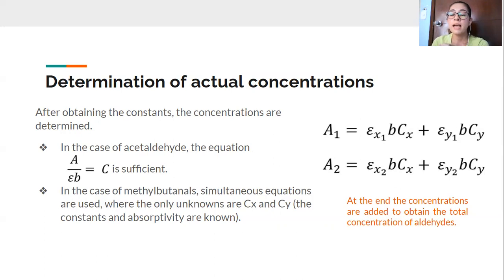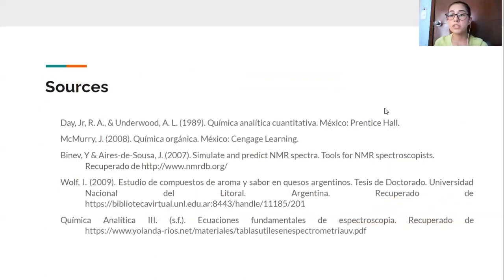And now, at the end, the concentrations of the three compounds are added to obtain the total concentration of aldehydes, and that's our conclusion. Finally, I added a last slide here, so you can check my references.